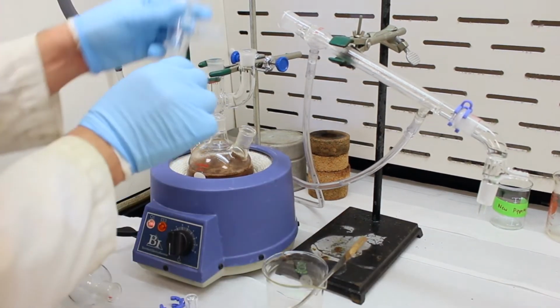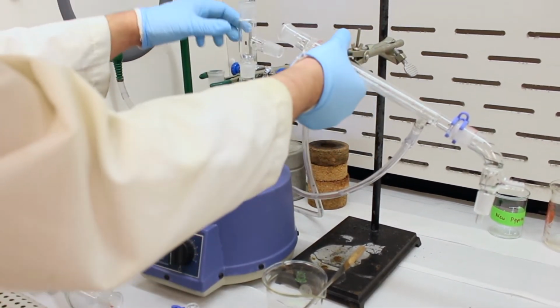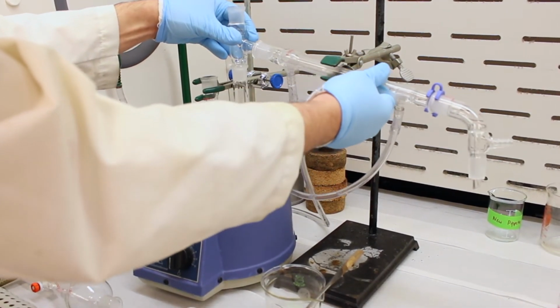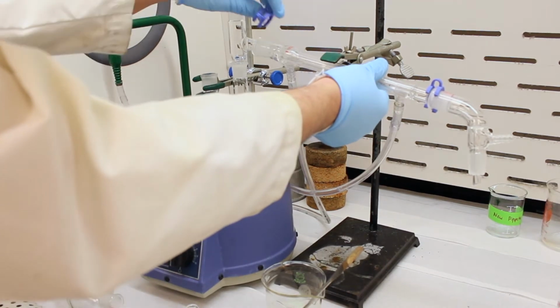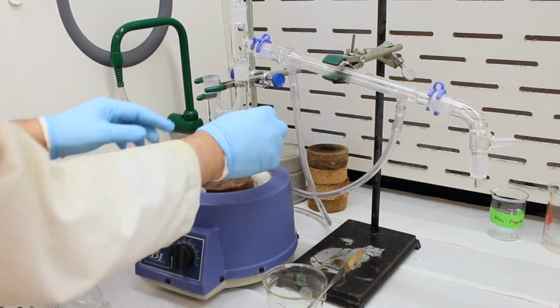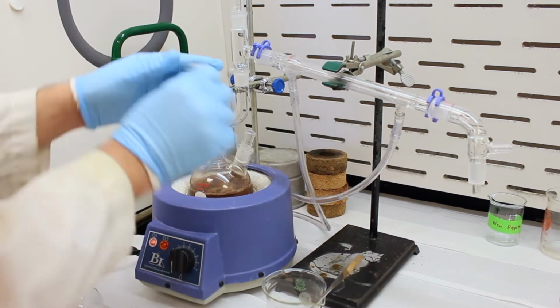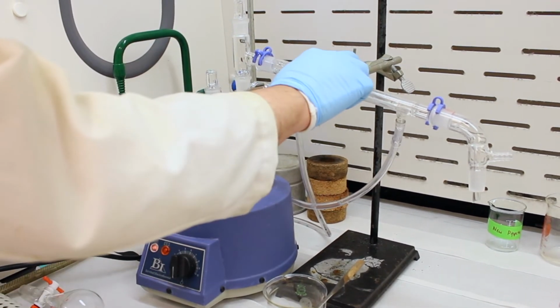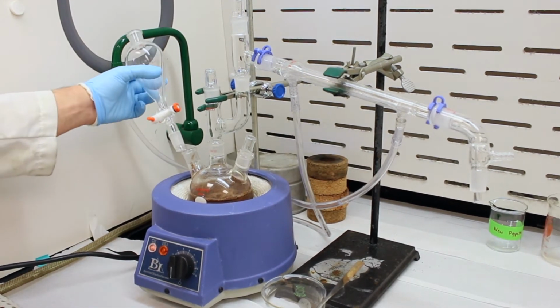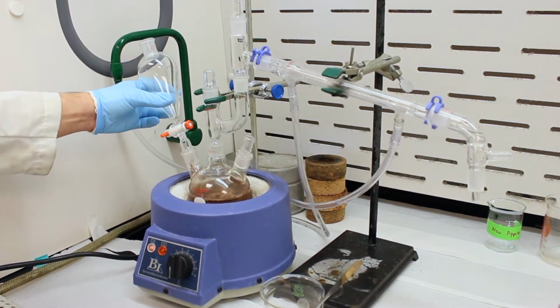So on top of that, we place our still head, and we can add the condenser here, and we can clip it in place. Then we can seal it up, so place some stoppers here. And then here, on this piece of glassware, we'll place our separatory funnel.